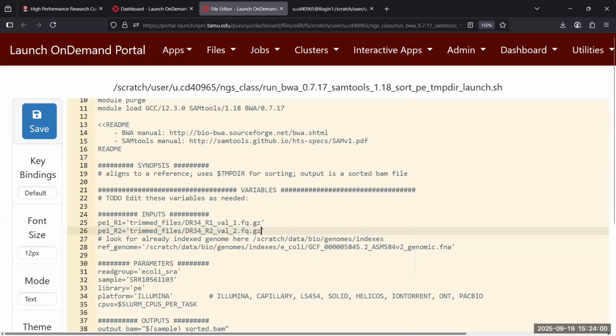Okay, let's let everyone get this first because we still have to do the genome. Did you get those edited? There should be a forward slash or start. Okay. Oh, TRI. So you can use the mouse, you use the arrow. Okay, so copy that file on the first one, R1.